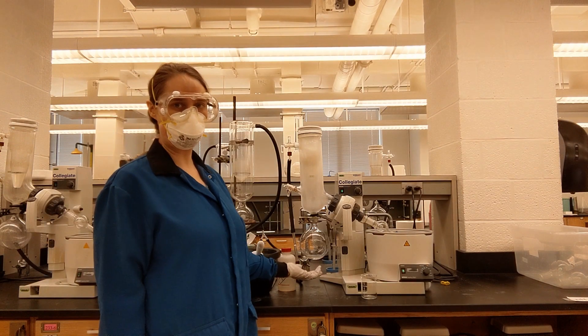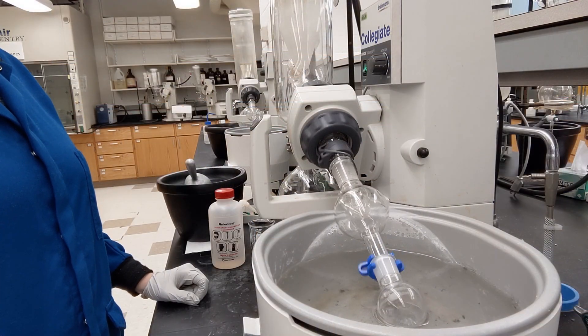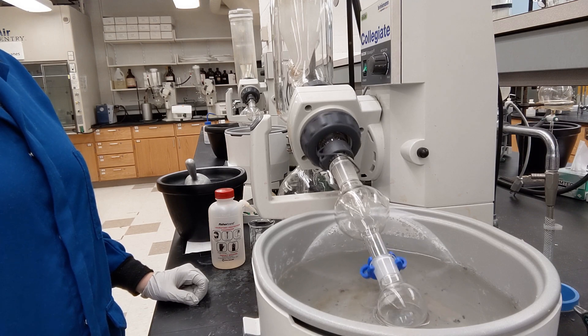The condensed solvent is dripping down to the bottom to be stored in this round bottom flask, which is just an easy place to clean later. This literally only takes a minute or two for this particular size of sample and the solvent that I'm using.